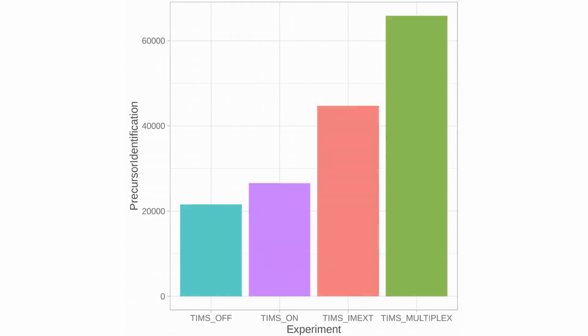diaPASEF is the next evolution of the DIA method, and it really takes the ion mobility component into DIA. And we will use diaPASEF to analyze large patient cohorts or analyze large experimental perturbations, which is required for any sort of systems biology or personalized medicine approach.